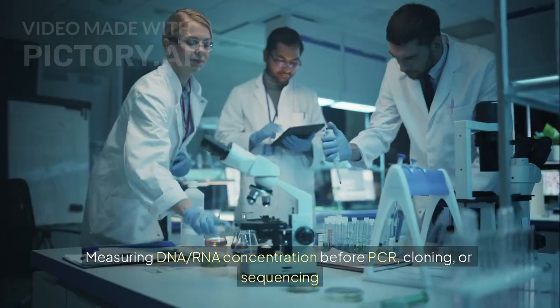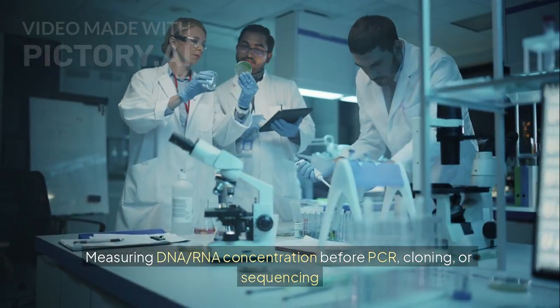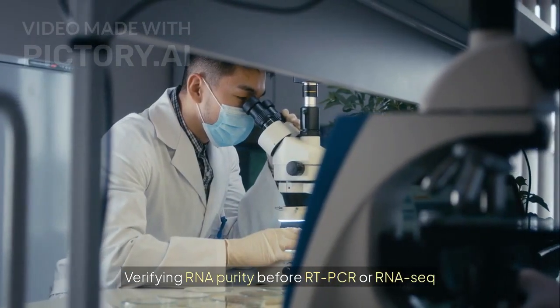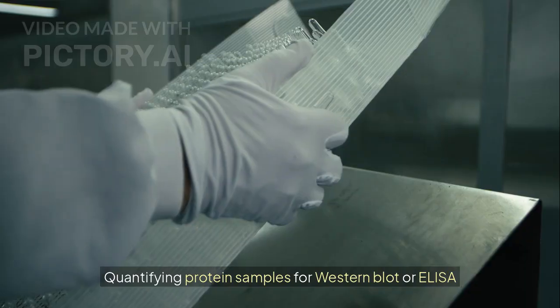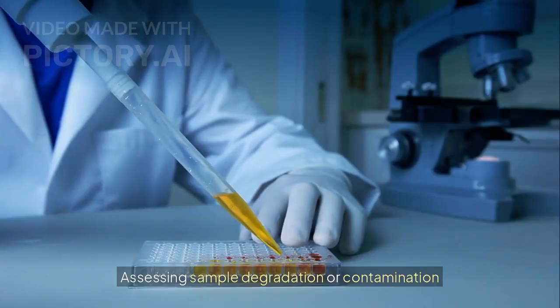Applications. Measuring DNA and RNA concentration before PCR, cloning, or sequencing. Verifying RNA purity before RT-PCR or RNA-seq. Quantifying protein samples for Western blot or ELISA. Assessing sample degradation or contamination.